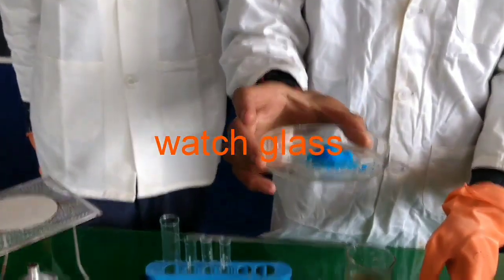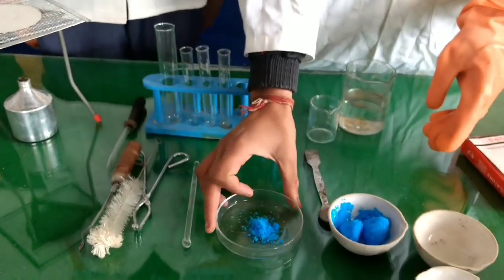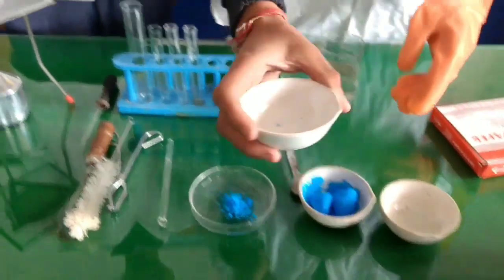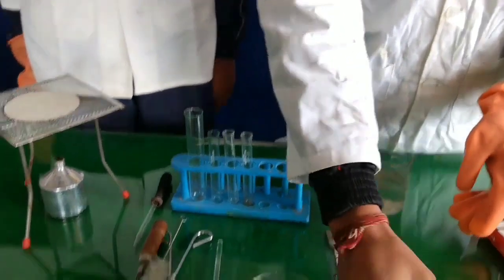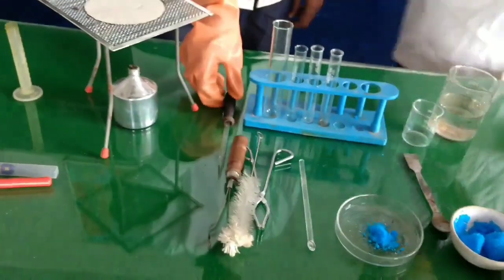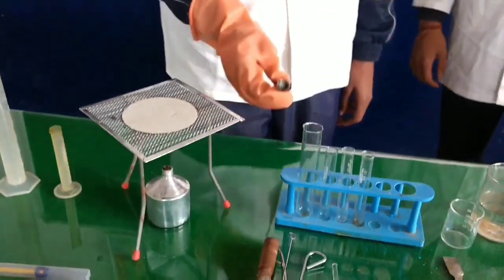Similarly, when you hold the solid in any bowl-like structure, then it is the china dish. And when you keep the solid in the transparent glass, then it is watch glass.